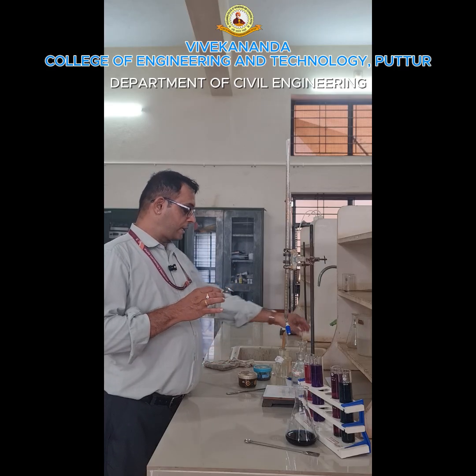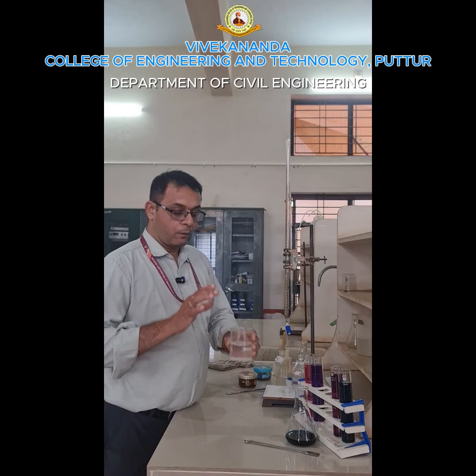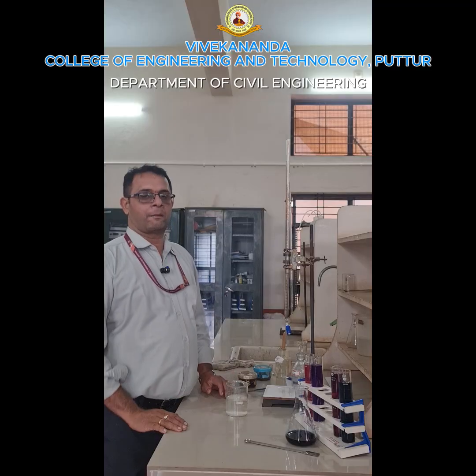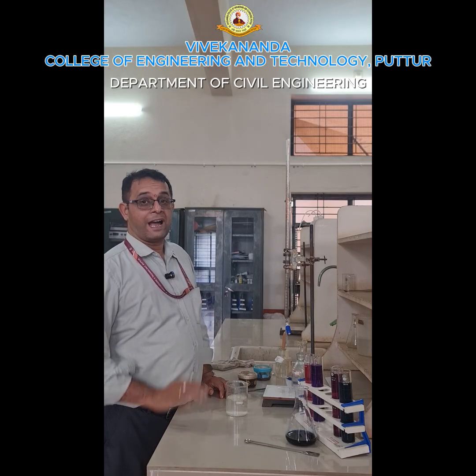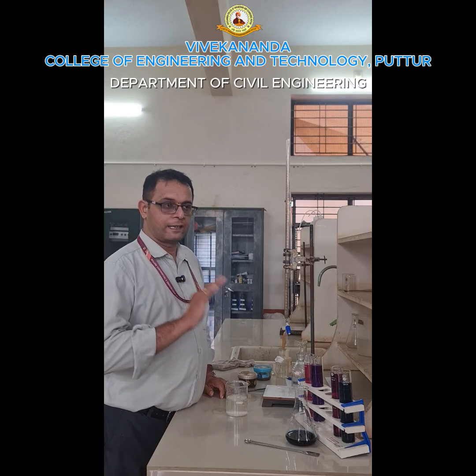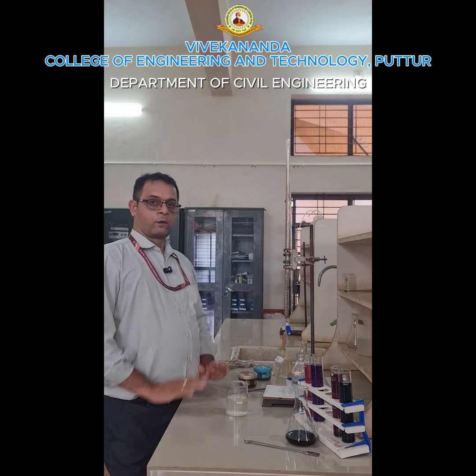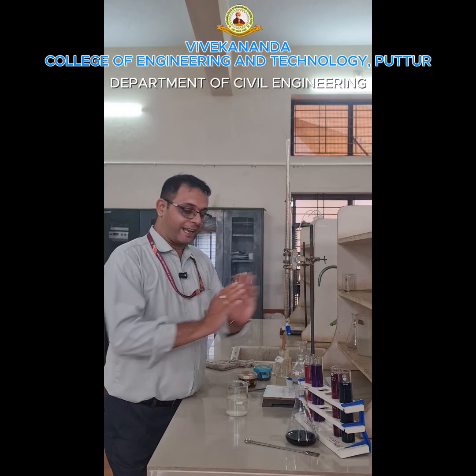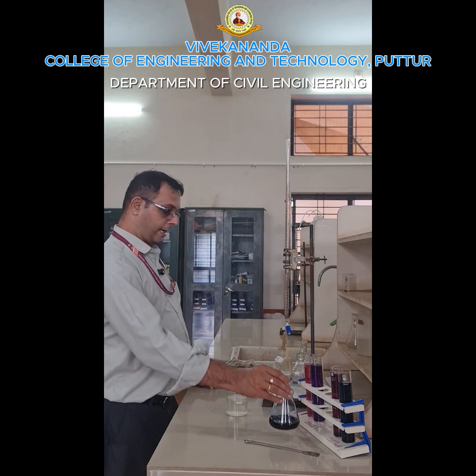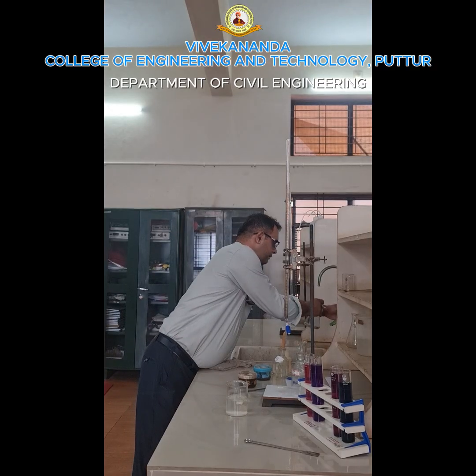Now, in a beaker, I have to take around 150 ml of the same sample which I used for the titration. I have to boil this in a heater or any other equipment you have until it reaches the boiling point. After water boils, allow it to cool. Then once again I have to repeat the same procedure. So what will I do? I will take 25 ml of sample.